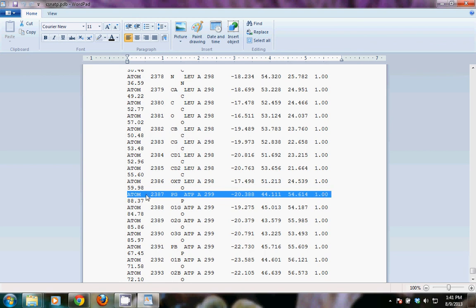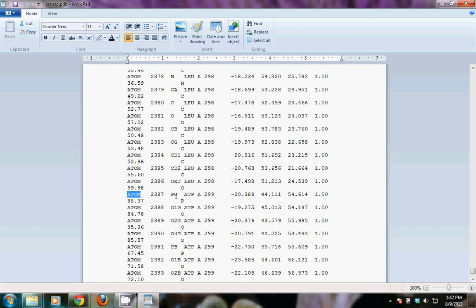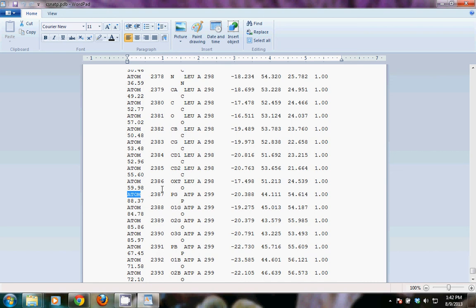This could actually cause some issues. You may want to manually go back through if you were wanting to work with the ATP. You might want to manually go back through and change these to HETATM rather than atom. Otherwise, it will think that is part of the protein when it's labeled in this way. And you would also want to add a terminal line after the end of the protein.